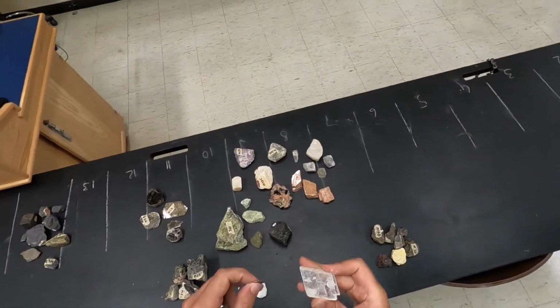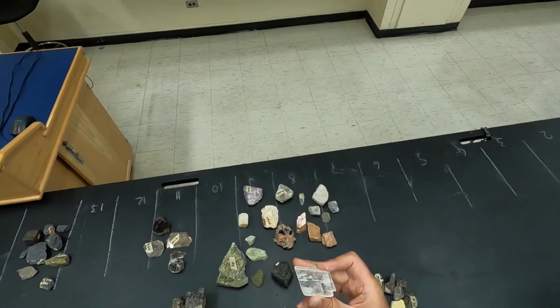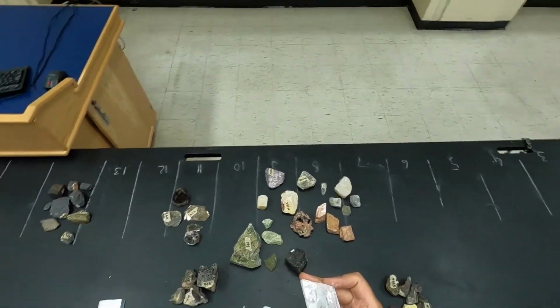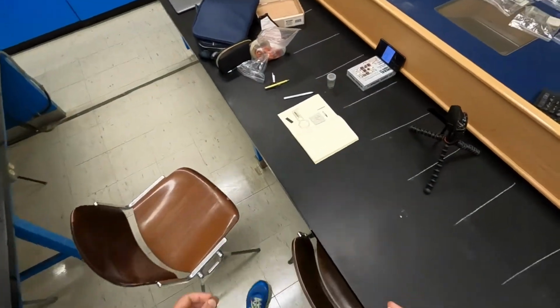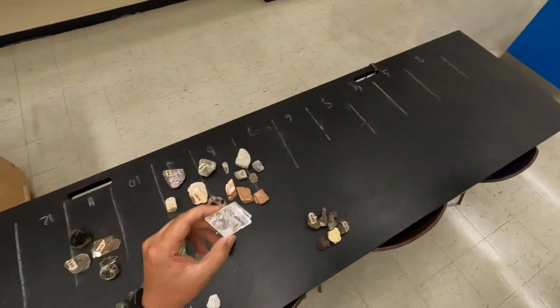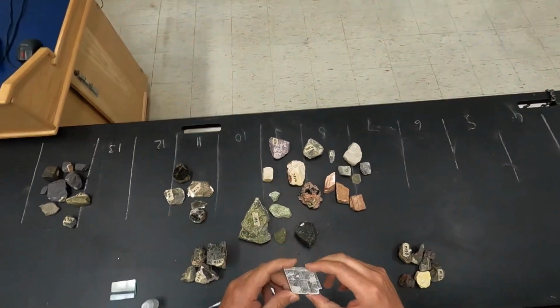So I made a big scratch here, another big scratch here, and so calcite not easy to scratch with a copper coin. So key distinction really here in terms of recognizing this mineral and comparing it against the calcite.